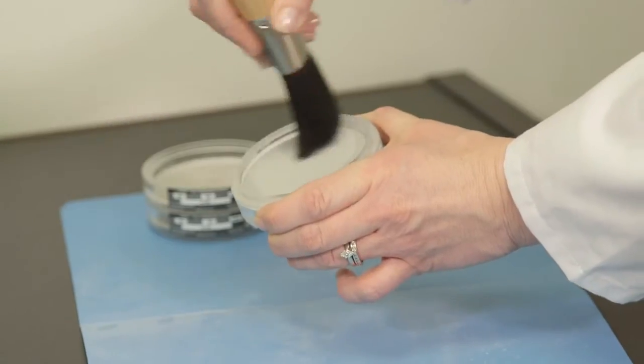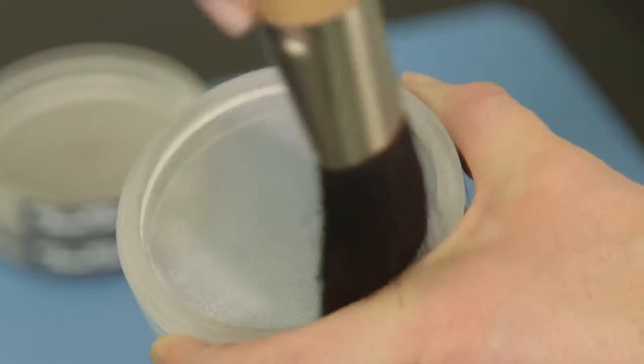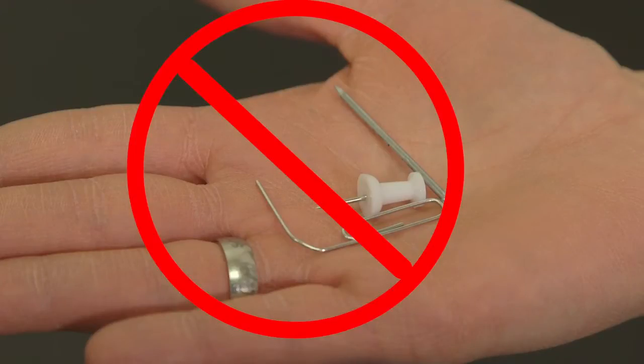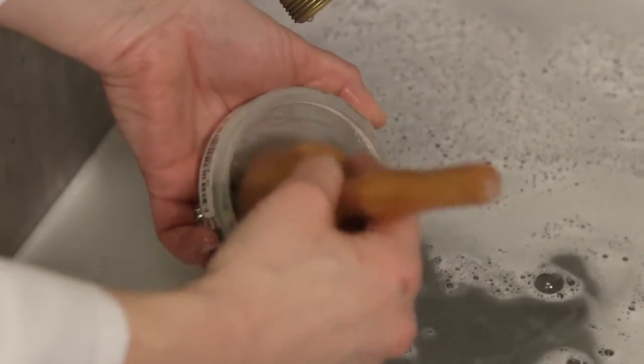When cleaning your acrylic sonic sifter woven wire cloth sieves, start by gently brushing the mesh from the underside only. Again, never use a sharp object to clear blinded areas.